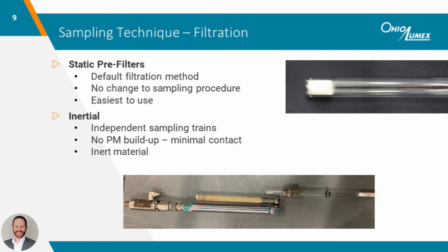velocity. Simultaneously, the sampler pumps pull gas through the filter and into the trap. The suction created by the pumps is not powerful enough to overcome the inertia of the particulate, so it escapes the filter and goes back into the duct.